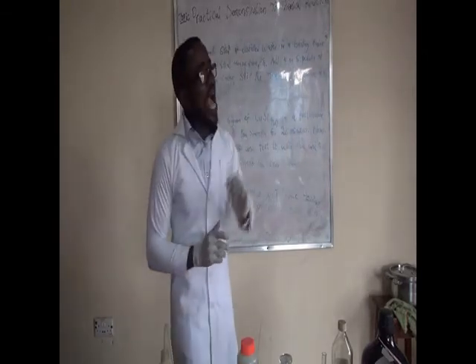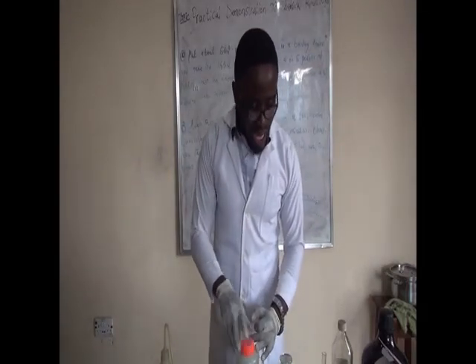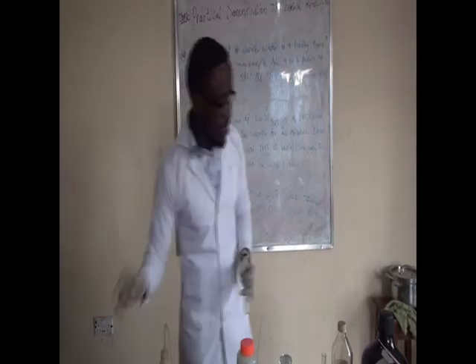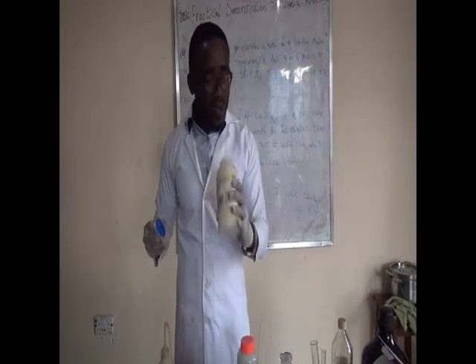Now, we are asked to drop the pellet of sodium hydroxide. This is what a pellet of sodium hydroxide looks like.